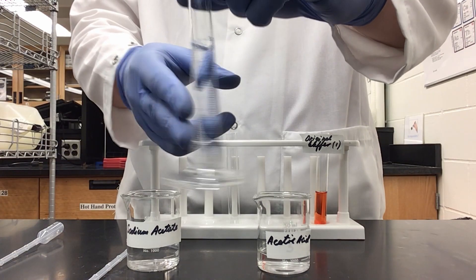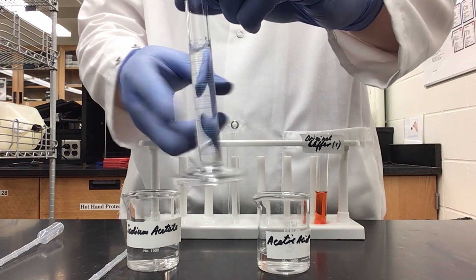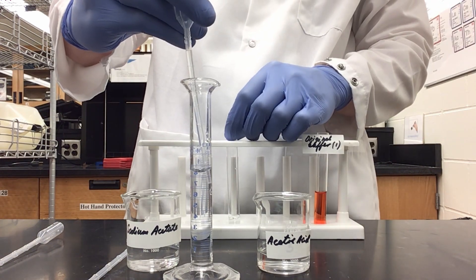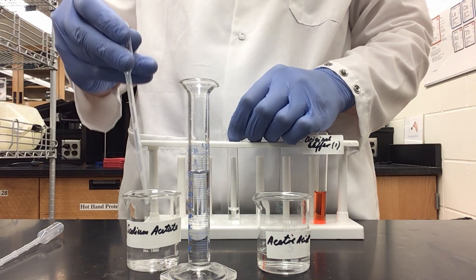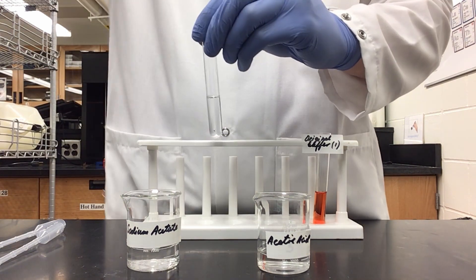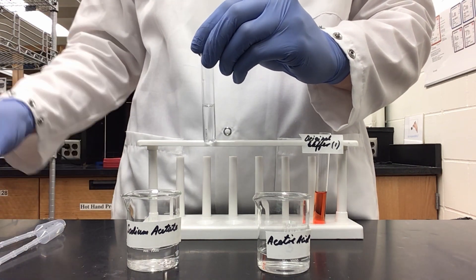I'm going to quickly tap to make sure my acetic acid and water are thoroughly mixed. Then I'll take 2 milliliters of my dilution into a new test tube, and then 2 milliliters of my sodium acetate, mix, and now I will add universal indicator again to check the pH of my solution.